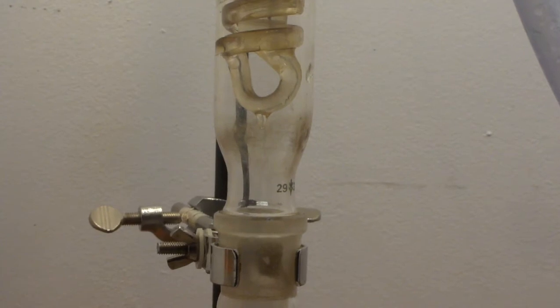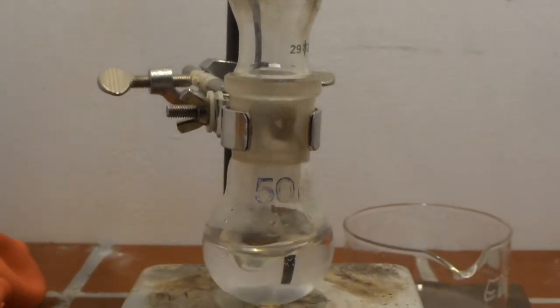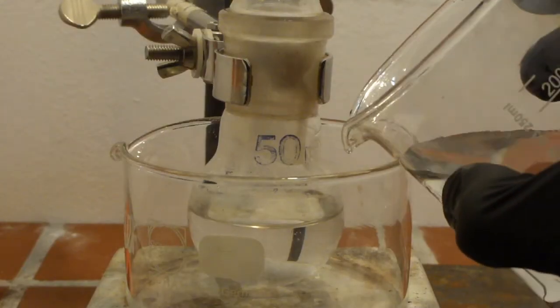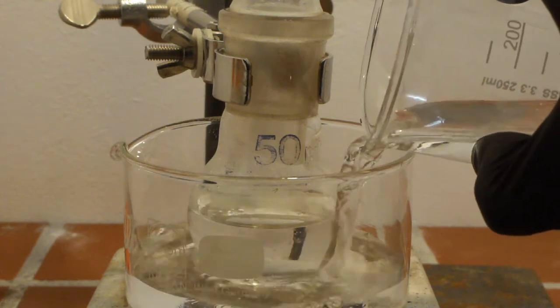We then set up a reflux condenser to reflux any escaping toluene vapor. We could of course also distill it out as an azeotrope with water. The mixture is then heated using a water bath.